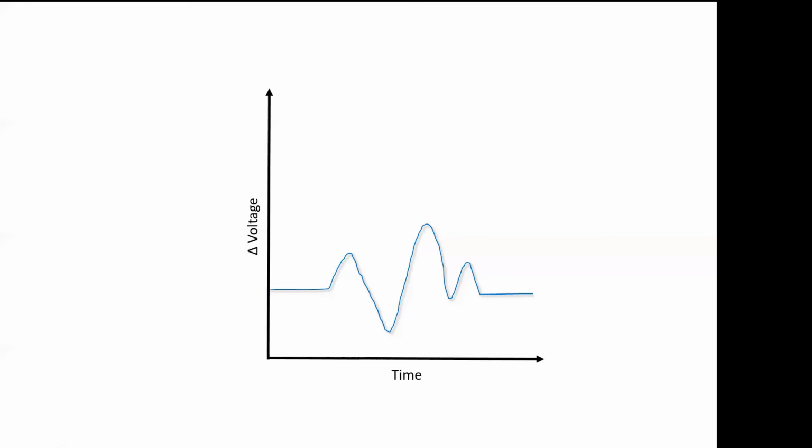So if we look at just raw data, we're going to get a number in volts. And that's because volts are our measurement for that electrical signal. Now we'll see that we then often convert these volts back into measurements about the body. So we'll then use these volts to calculate, for example, someone's pulse or someone's heart rate. But if we're looking at just the raw data, what we're going to be looking at is just those volts coming in from our transducer.